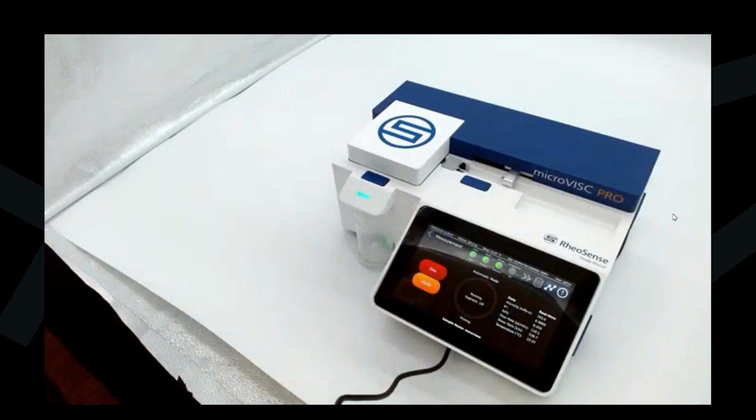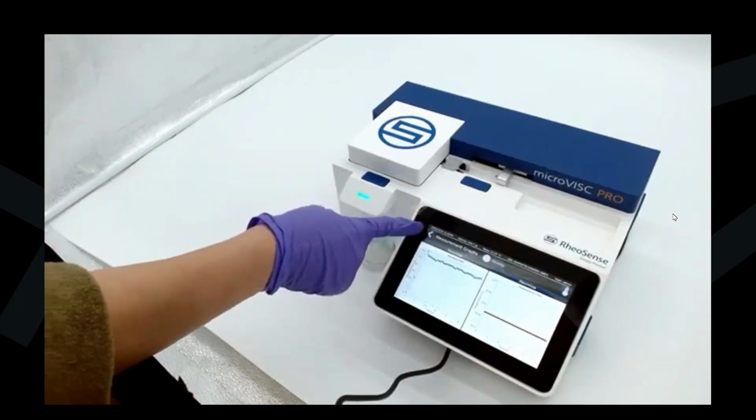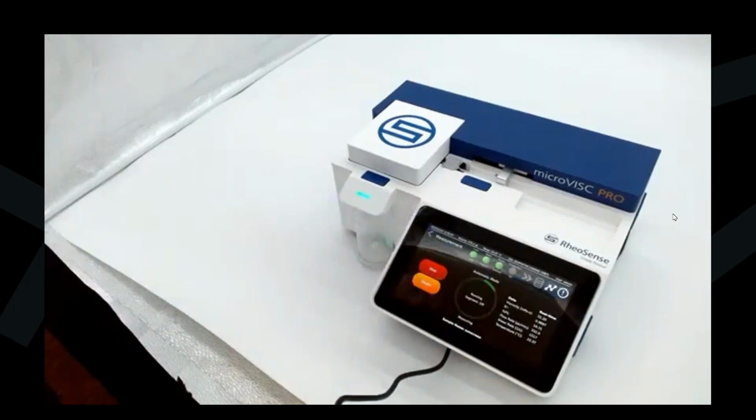Your viscosity, percent full scale, where we want to be between 5 to 95%, and other parameters you may be interested in. Now it's already running the second segment at the selected shear rate. We can see the viscosity versus time on the left looks very good, very flat, very steady state. Again, you can see the real-time data for that sample.